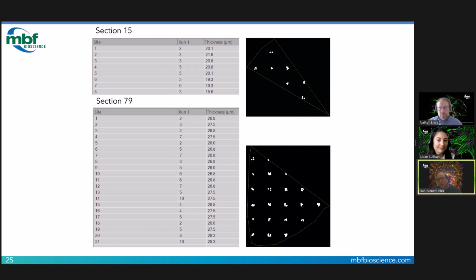Yes, it's okay if there's maybe 3 or 5 sites that have a section thickness that is a little bit thinner than your dissector. As a rule, we don't want the tissue sticking out of the dissector. We want the dissector to be contained within the section. But when you're setting up a study like this, it's okay to have a few that are slightly under. It's just something that sometimes has to be accepted.